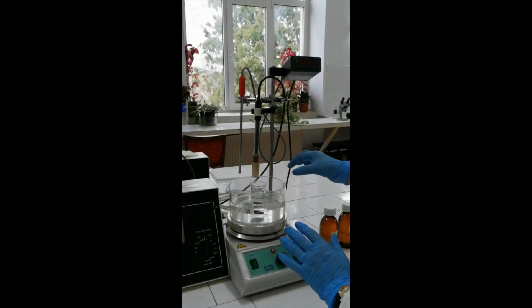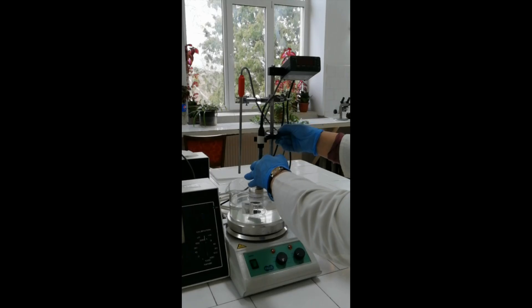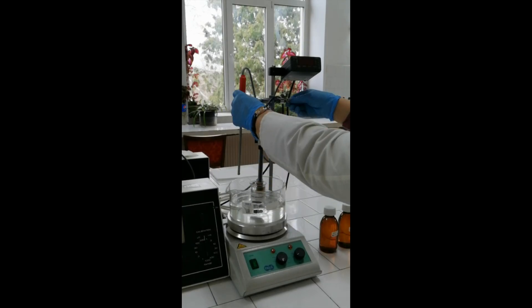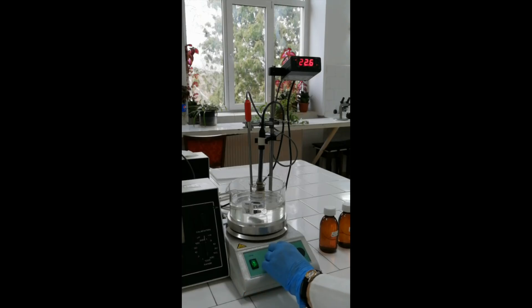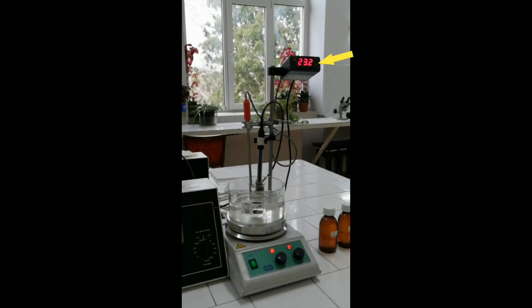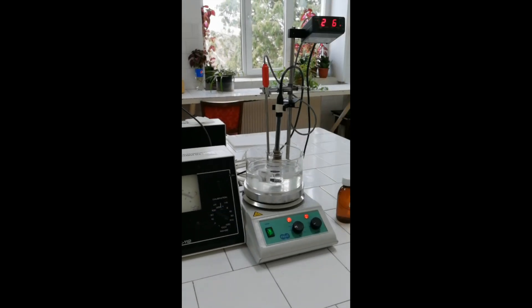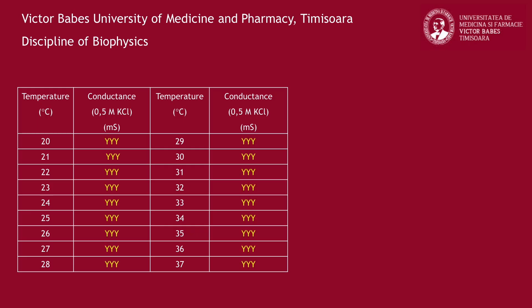Dip inside the study solution both the measuring electrode and the temperature sensor. Turn on the magnetic stirring. To start the heating, rotate the temperature control knob up to approximately 50 degrees Celsius mark. Read the solution temperature on the digital display of the thermometer. For each integer value of temperature, read the conductance value and record it in the table. After reaching 37 degrees Celsius, stop the heating and the magnetic stirring.